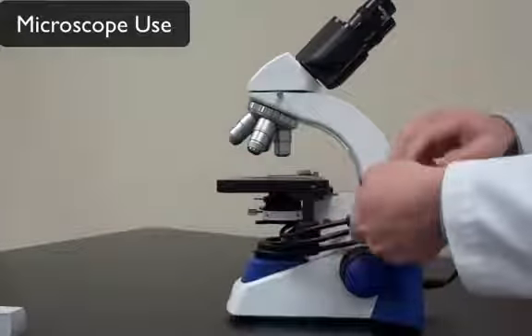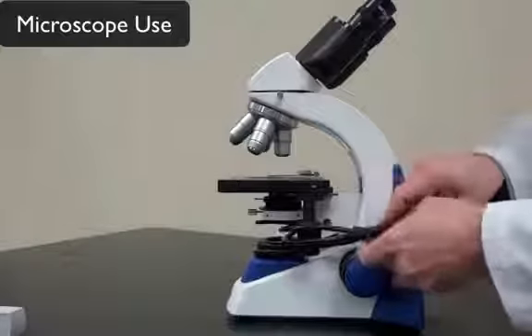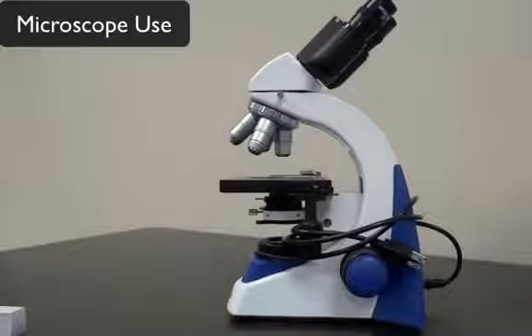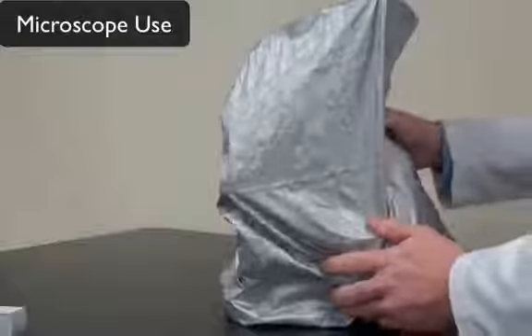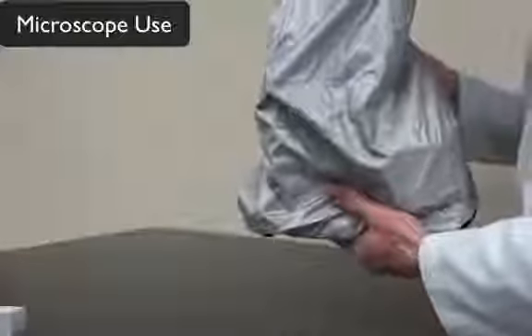Then you can tuck that into that area, place the cover back onto the microscope, and put it back into its original place, using the arm and the base to carry it and lift it to where it needs to go.